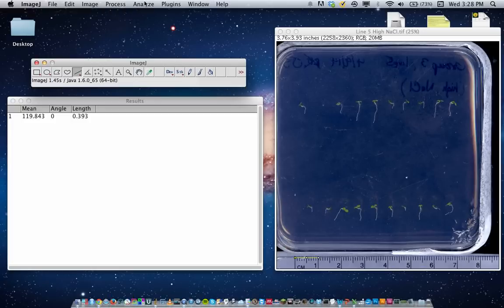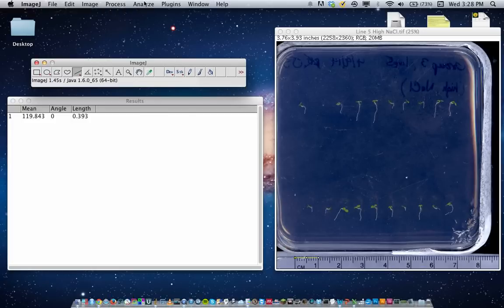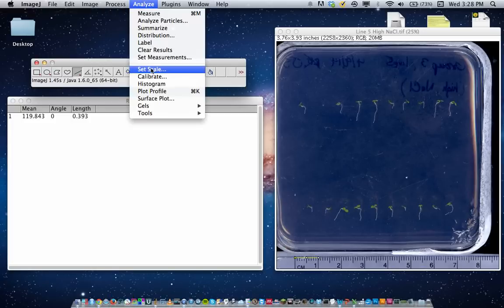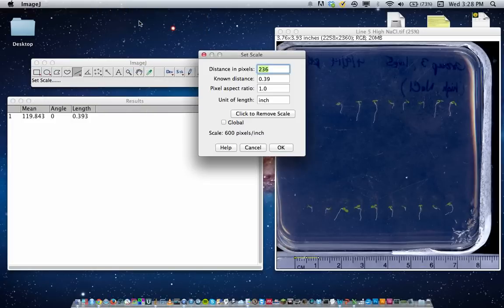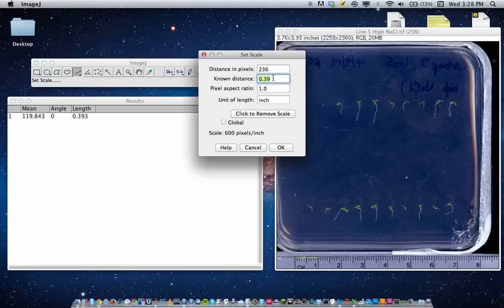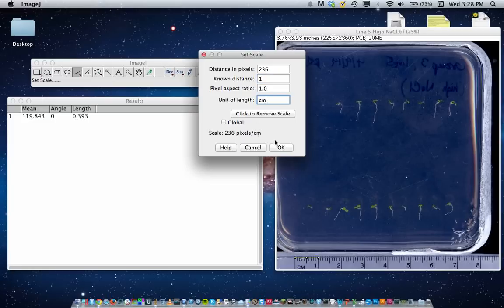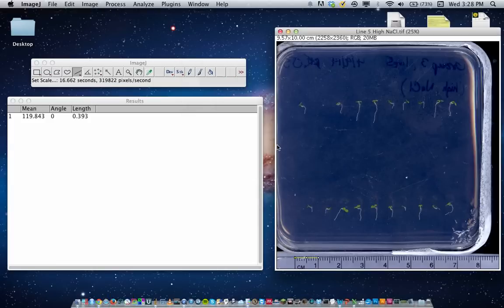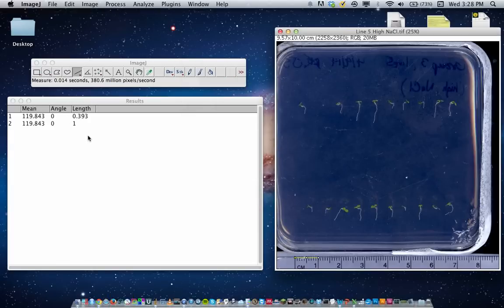In order to set the scale, go to Analyze, Set Scale. So that's the distance in pixels. We know the known distance is actually 1 for 1 centimeter. Leave the pixel aspect ratio, change this to centimeter, and hit OK. Now if I hit Command M again, we should have a length of one centimeter. So that's good.